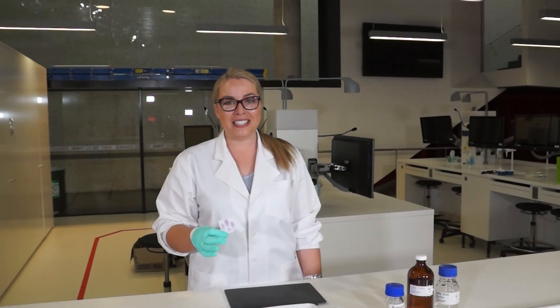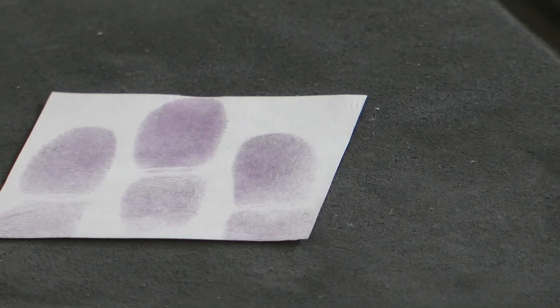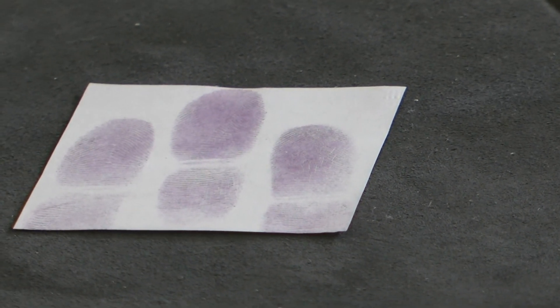After 20 minutes in the oven we actually have a beautiful sample here. The ninhydrin has reacted with the amino acids in the fingerprint residue and given us this beautiful Ruhmann's purple colour. We can then take this finger mark, if it were evidence, and compare it to any suspects we might have for the crime or to our National Fingerprint Identification Database.